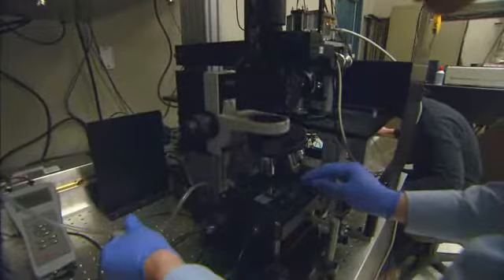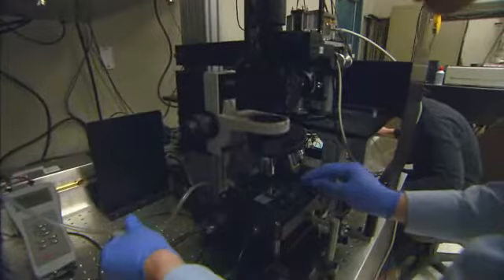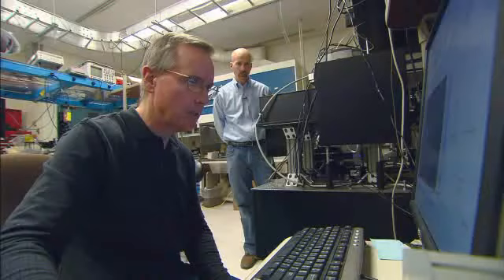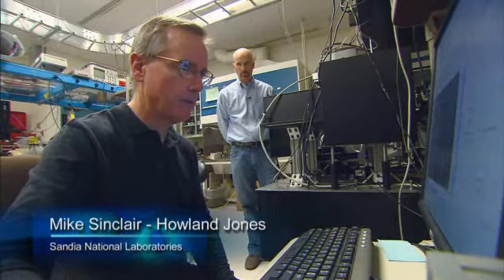So we've just put the slide on containing the raw cells and we're looking for cells that are suitable for imaging. What we're looking for are cells that contain a fairly large amount of the fluorescent species that we can see with our microscope.